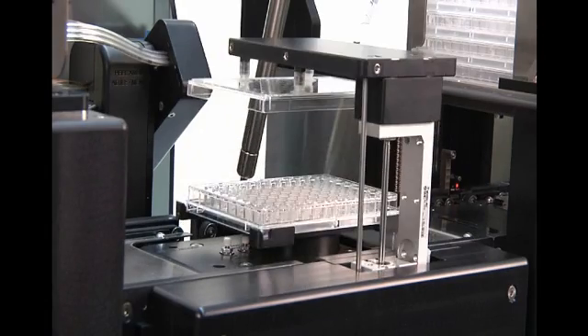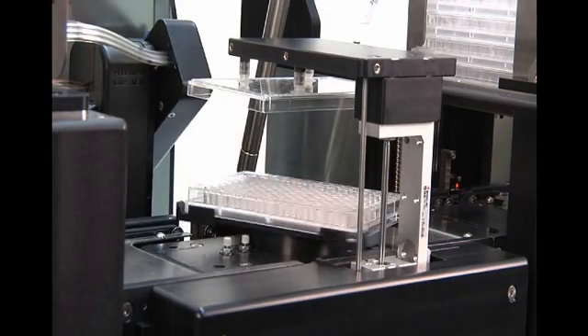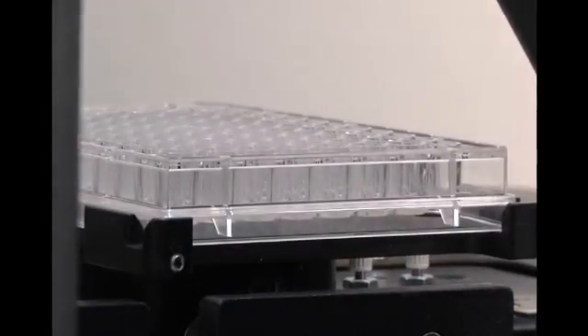Lids can be removed with the optional de-lidder. The platform rotates to provide printing on multiple sides of the plates as required. The printed barcodes can be verified with a barcode reader. Depending upon the configuration, the system can process five to six plates per minute.